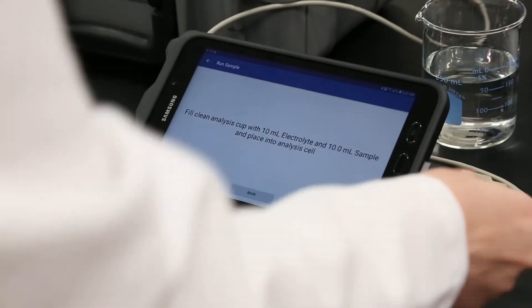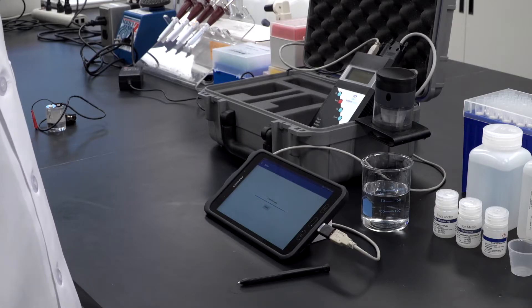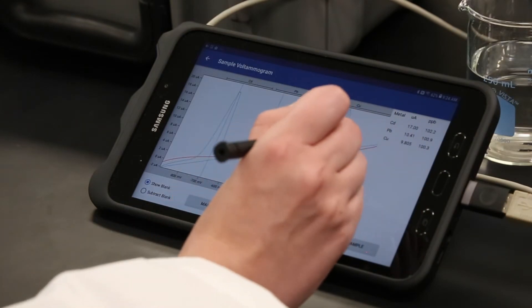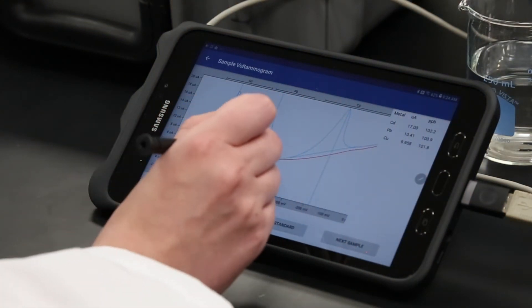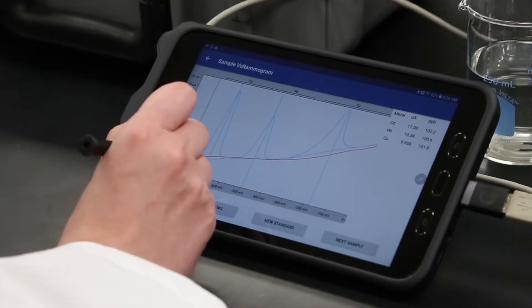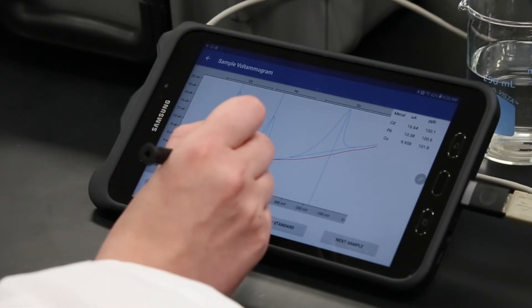Click Next to initiate the sample analysis. Once the analysis has been carried out, the voltammogram will be displayed, along with the peak height and part per billion value of the sample. Now the user has the option to adjust the peak center and baseline by dragging them to the desired voltage as for the standard. This is not usually necessary. This completes the basic analysis cycle for a single sample.